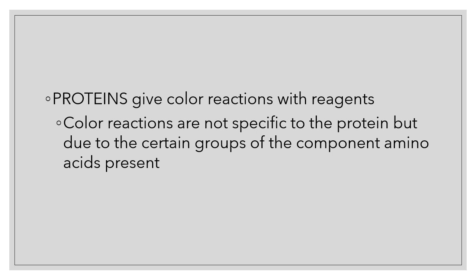Other than that, your proteins will also unite with some dyes, like picric acid, methylene blue, and others.